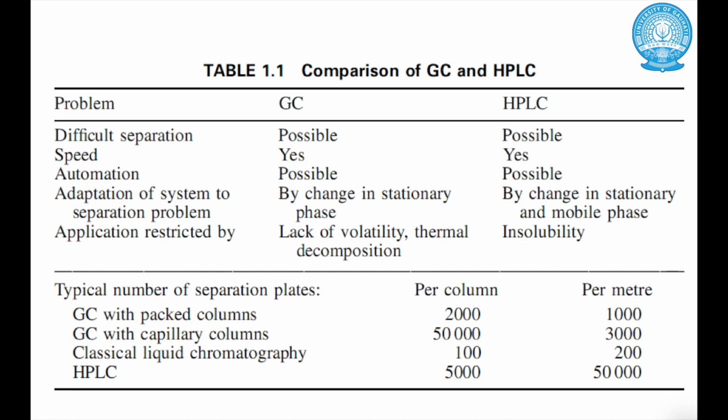So this theoretical plate or separation plate is provided by the interaction of the compound with the packing material.